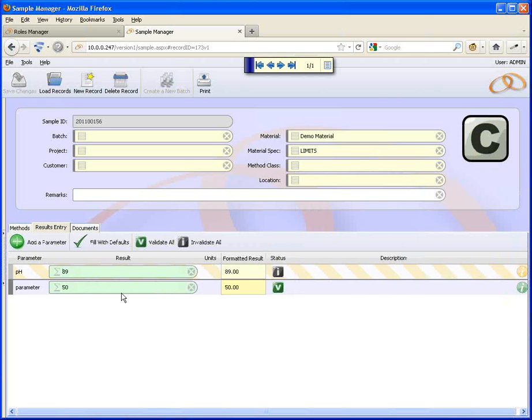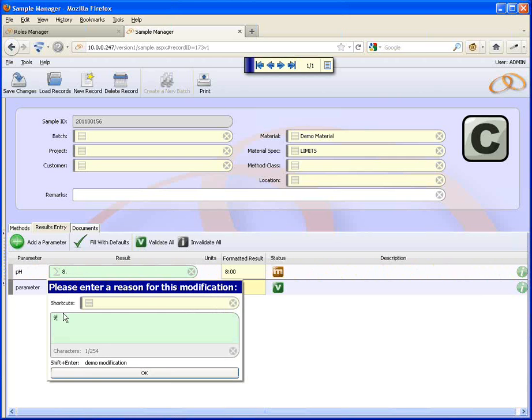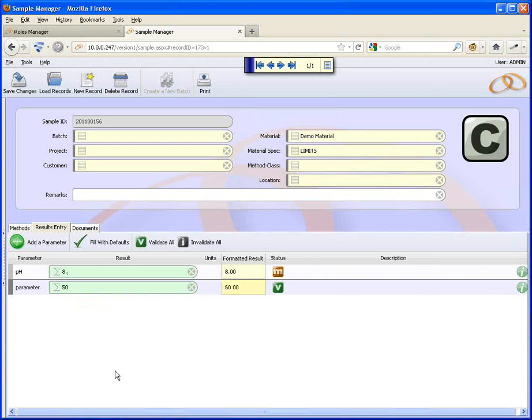which then means that someone could come along and say, oops, I actually meant 8.9 rather than 89. That's me doing incorrect typos there, so never mind, I'll just put typo. I was trying to put 8.9 in it, like that. Okay, and then I could say, right, I'm happy with that.